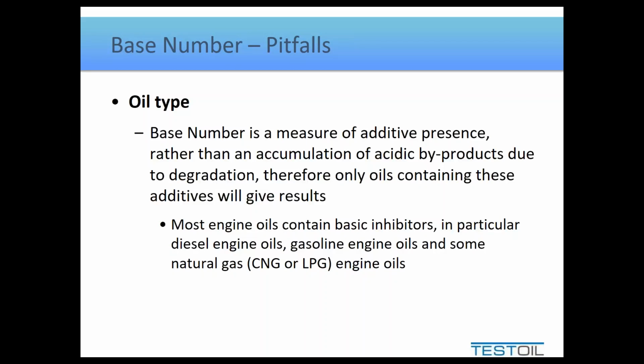The next question says, can an acid number test be replaced by TBN by FTIR? Well, as I said, you could replace these titration tests with FTIR, provided that the FTIR has been calibrated accordingly for that oil type. That's not an issue. Replacing acid number with base number, again, is not an issue so long as there is a base number that can be measured.